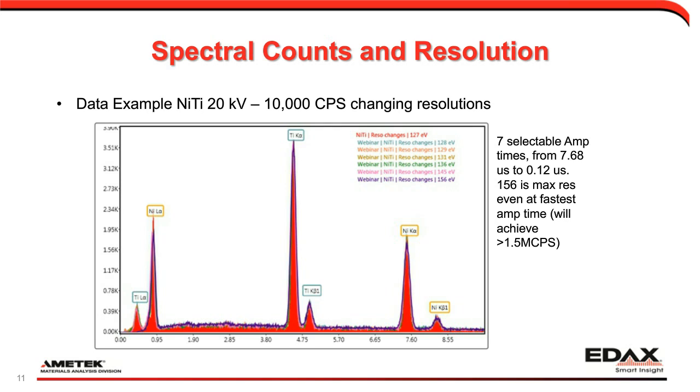There's also a question about which lines are used for quantification. In general, we recommend to use the highest energy line available because there's typically less peak overlaps and less background contribution in those ranges, but it can be selected in the software. Generally, whichever line you click and add into the spectrum is the one used for quant.